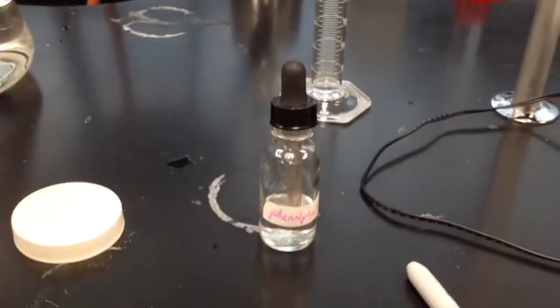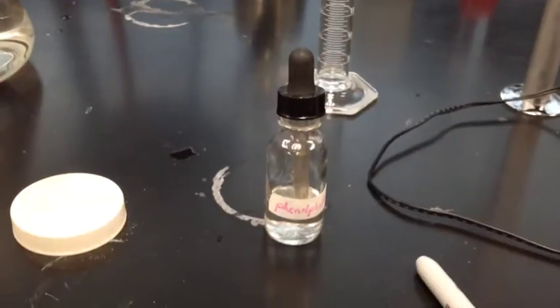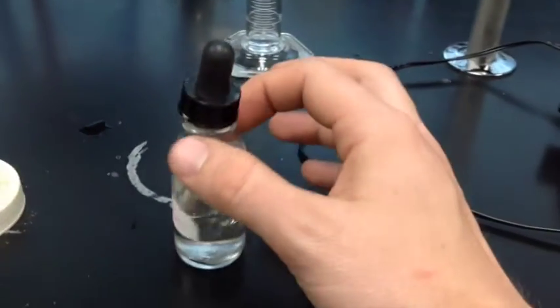How we use it in a lab is we dissolve it in ethanol. It's not soluble in water. It's very weakly soluble in water, more correctly. And so we need to dissolve it in something, and alcohols tend to dissolve it. So it's just a simple solution to make, and you'll often work with phenolphthalein.